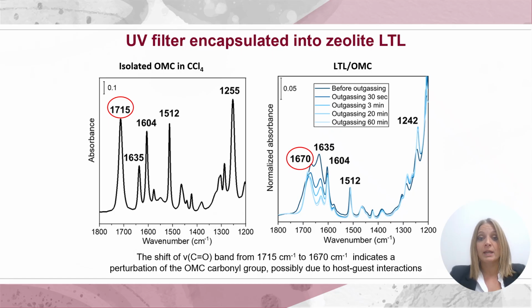We were also able to see that, unlike acid zeolites, which protonate and suppress modes of the filter, LTL preserved the molecular backbone. So now we know that the molecule is inside, but it's really difficult to understand the amount of the molecule inside and the interaction between the molecule and the zeolite without X-ray.